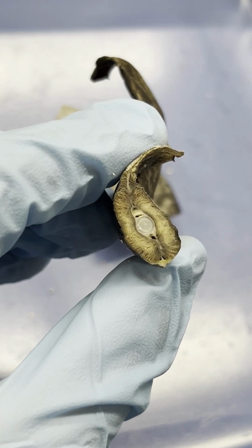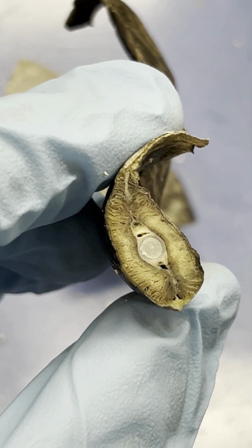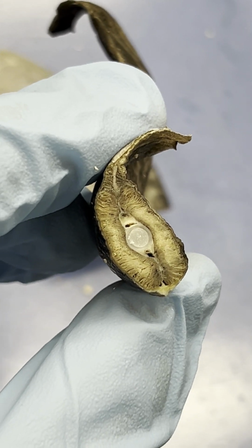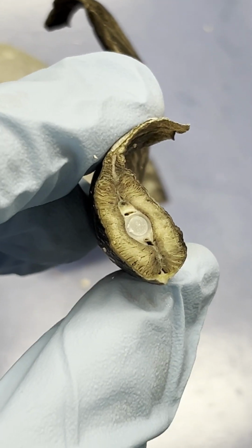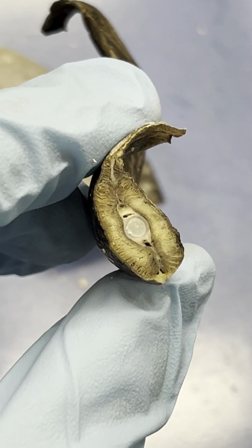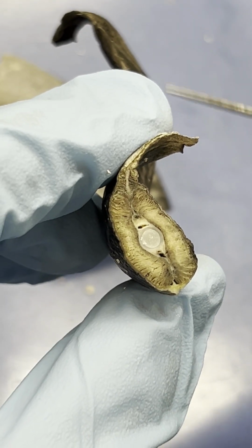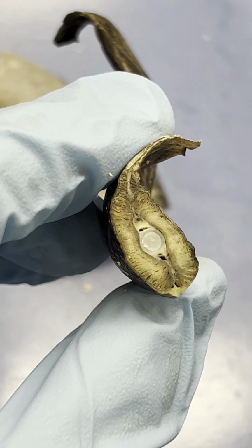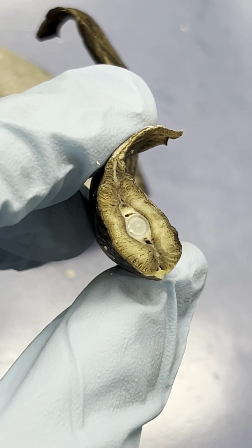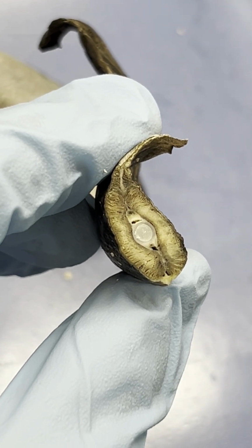Hey guys, so we're going to go over the different cross sections that Dr. Mick beautifully did. For whatever it's worth, I am going to go backwards in the lab manual. What I mean by that is there are 4 different cross sections, but I'm going to start with 3.6D first, which is the tail cross section. Why I'm doing that is because the tail is the easiest for all the structures. So I want to get you guys off to a good start before we get to more structures.